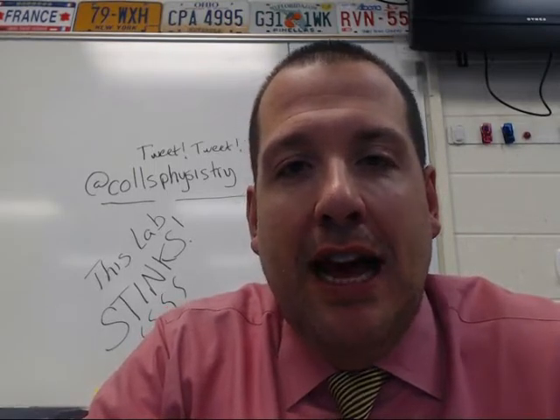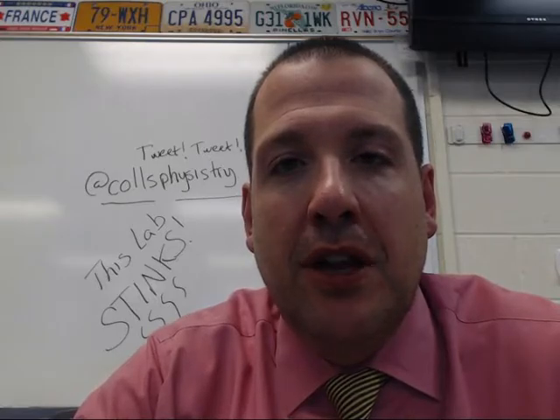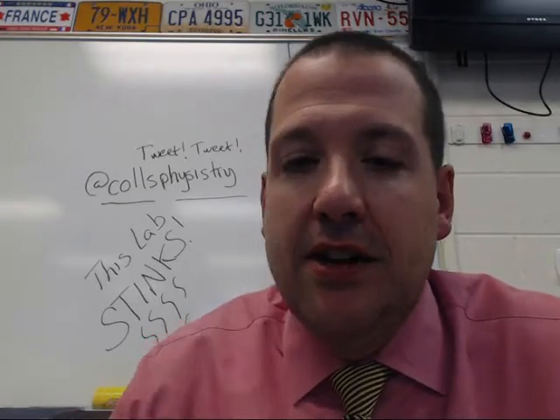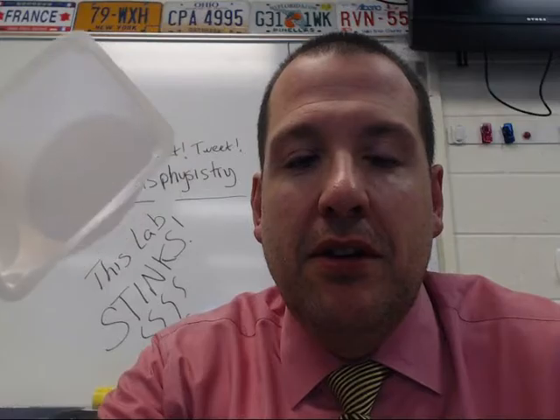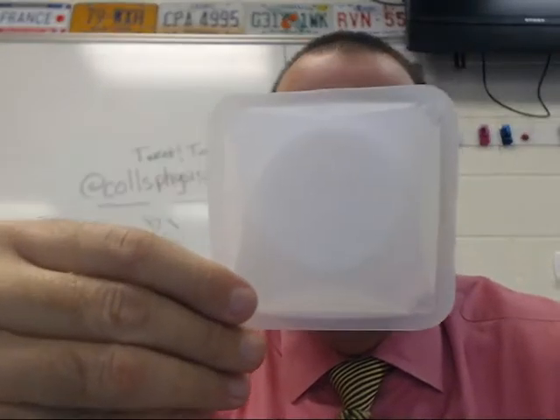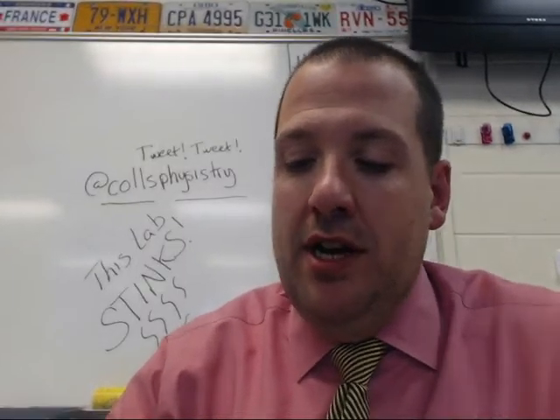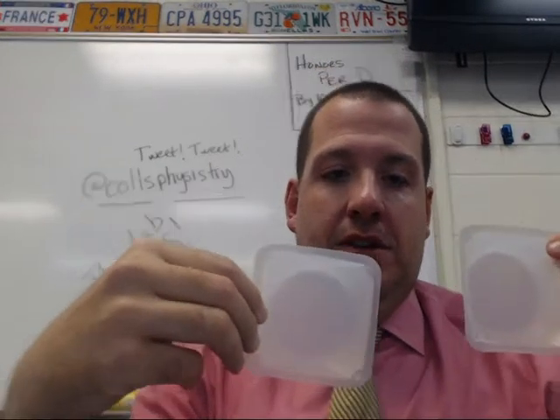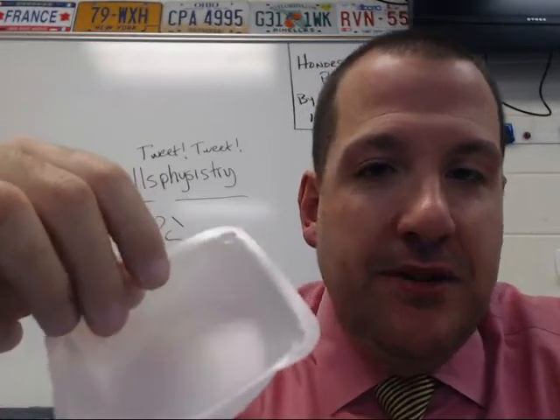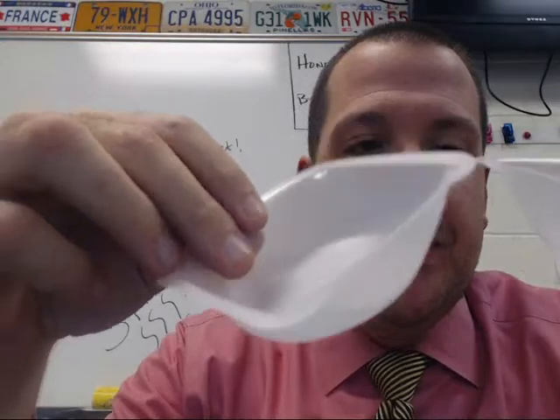As you read through the lab, which you can find right in the Google Classroom, you'll find that you're going to weigh out some iron in one and sulfur in another. And when you do that, you're going to then take a lot of observations in this.